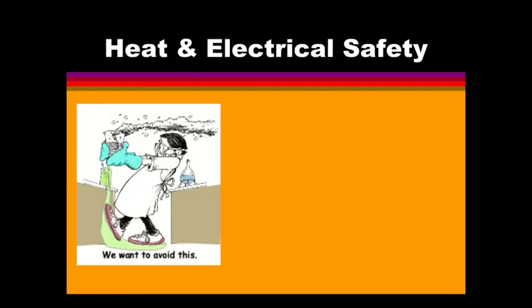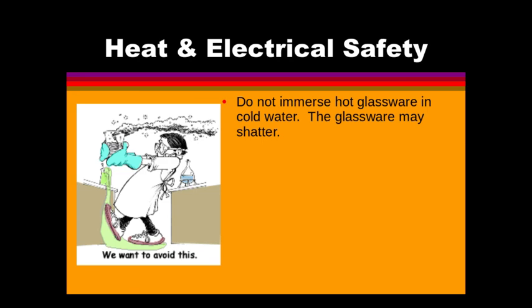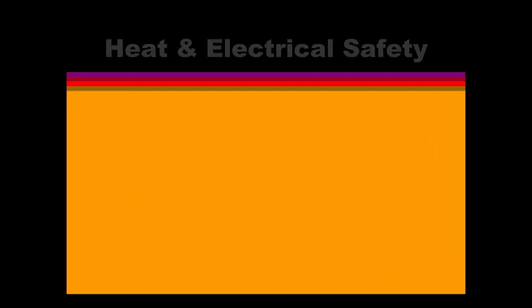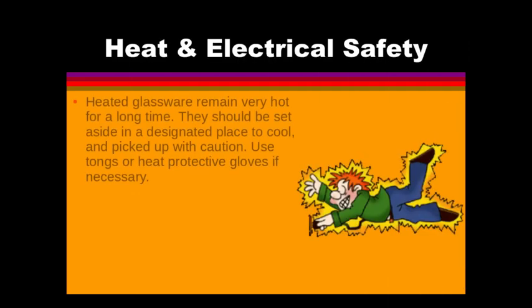Heat and electrical safety, most of us already know this. We don't immerse hot glassware in cold water because the glassware will shatter and crack. Don't operate a hot plate or any electrical device near water. Take care that your hair and clothing and hands are a safe distance from a hot plate at all times. Use of the hot plate is only allowed in the presence of a teacher. You cannot do it in the room by yourself.